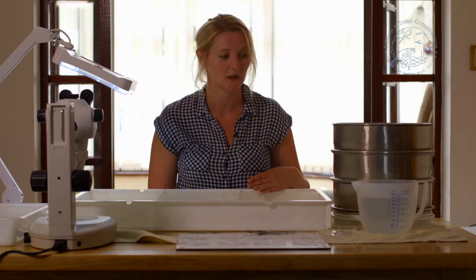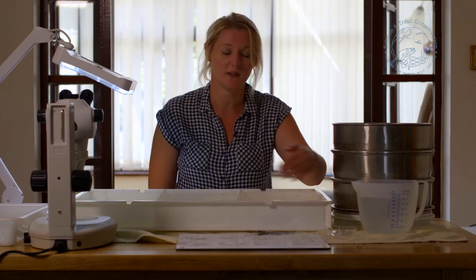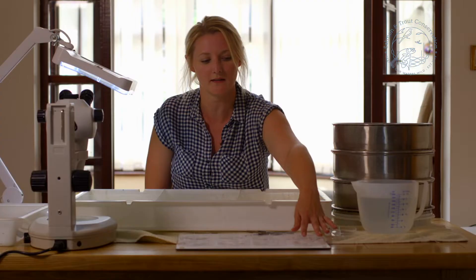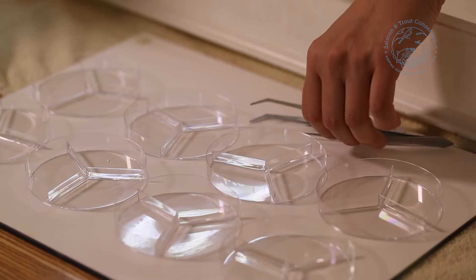In addition to your sieves, you're going to need the equipment that you'll use when you sort through your sample. You'll need a jug of water — probably several jugs — for getting the sample into the tray and then putting it into your dishes afterwards. The dishes we use are the triple vented petri dishes, but you can use other kinds. We have 8 dishes here so that you can separate into your 8 groups.